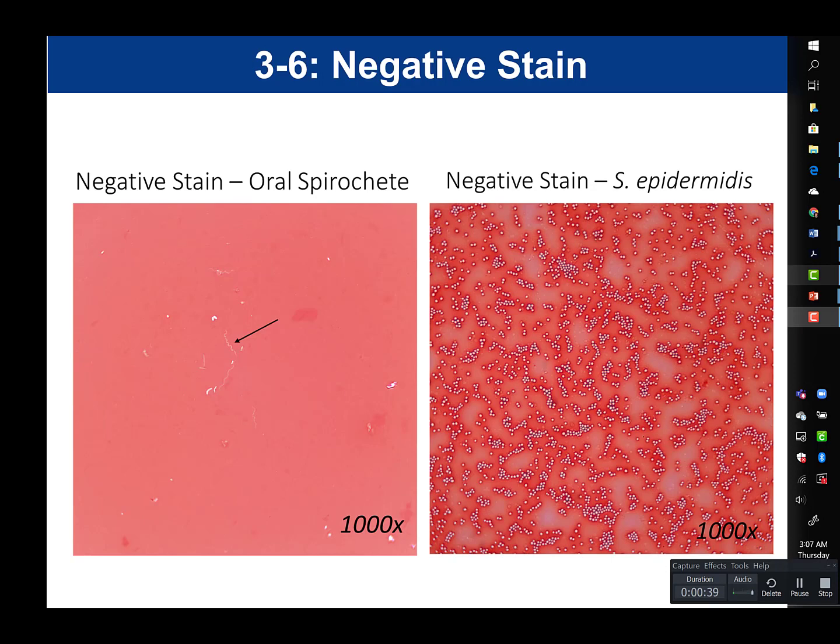In the video, he's doing the experiment using bacteria that's on a plate. But otherwise, the technique is the same, and so it's just a way for you to visually see the way that the negative stain works. And so you'll want to watch that in addition to this to just see how the procedure is done. And so that will conclude our lab on the negative stain.